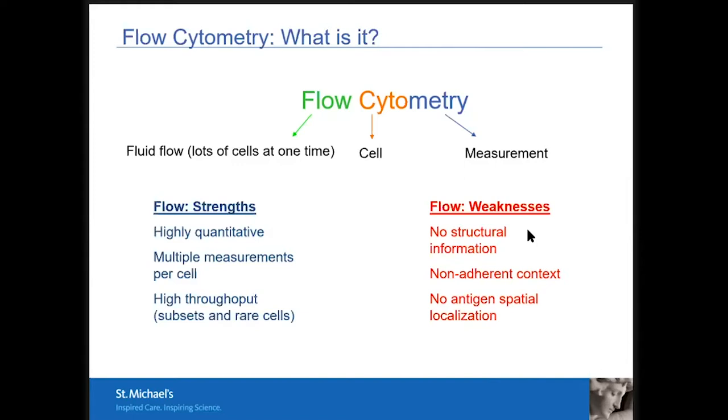I don't like doing microscopy and drawing regions of interest, and then 2 hours later you get data and all this information, and then you realize the segmentation wasn't good. Go back and do it all over again. Flow cytometers give you your fluorescence information in real time, immediately as you put it through the flow cytometer. You can do, let's say, 30 colors at a time, very much dependent on the instrument, and you get high throughput of cells, 10,000 cells per second.